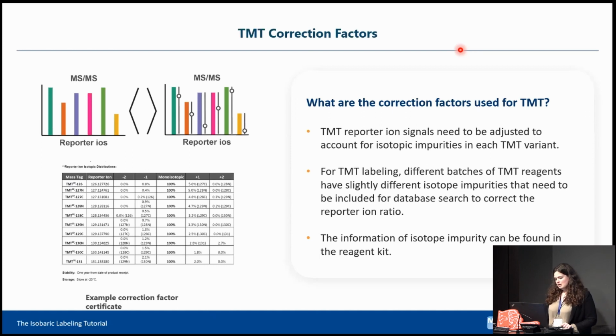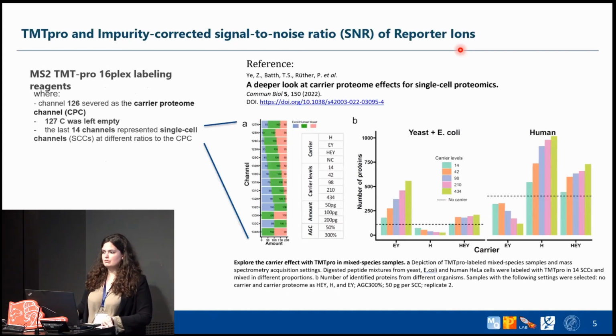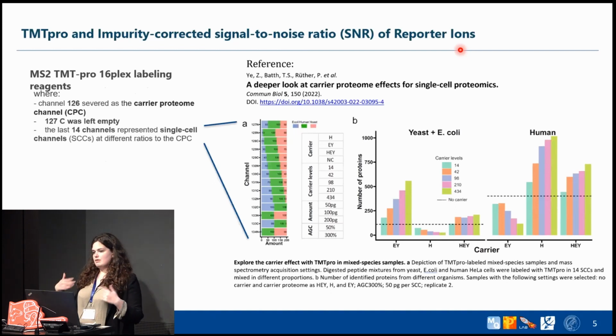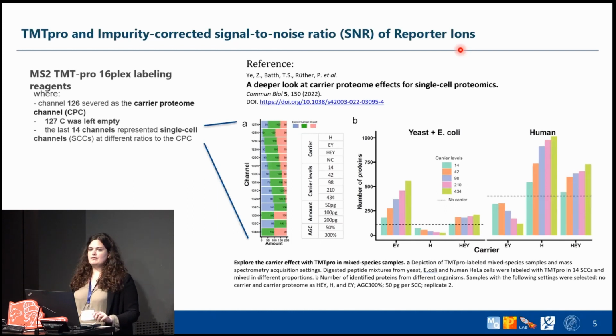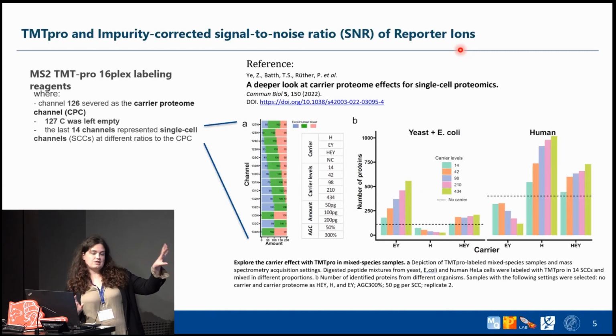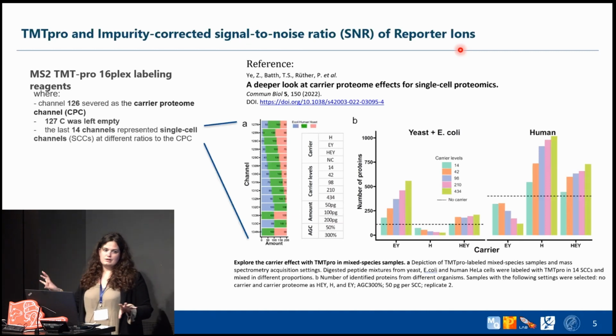To do so, I would like to take an example exactly from a paper. Why? Because until now, also in the previous summer school, what we usually did is that I give you some raw data, whatever these data are from. We don't explain the experimental design in the tutorial, but this year we prefer to tell you from which paper we took this data, see the experimental design, and then from that tell you the goal that we have for our tutorial. Of course, this is the paper that we use now, but we will not go through all that they did in the paper.